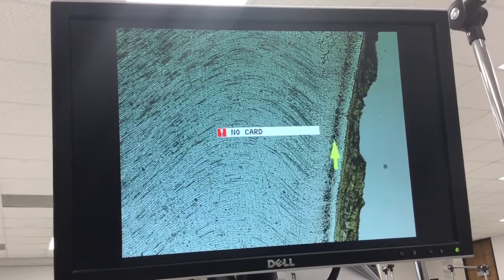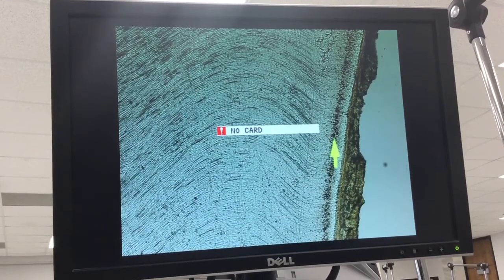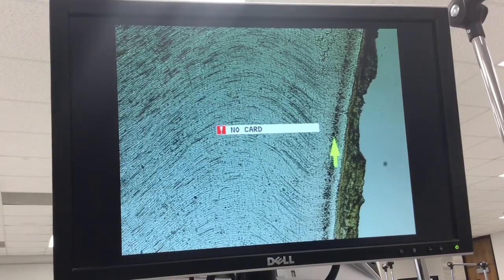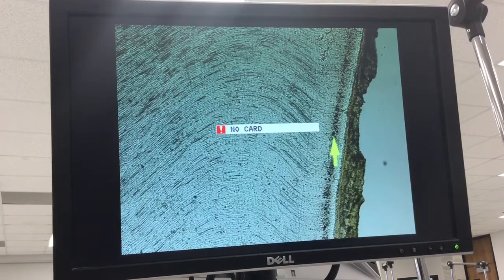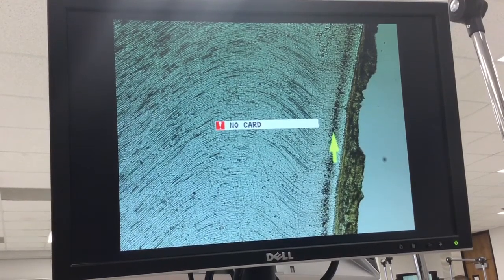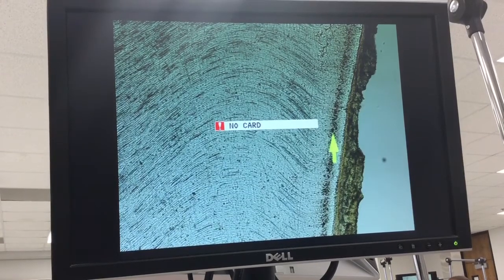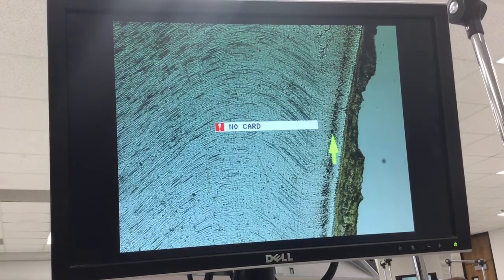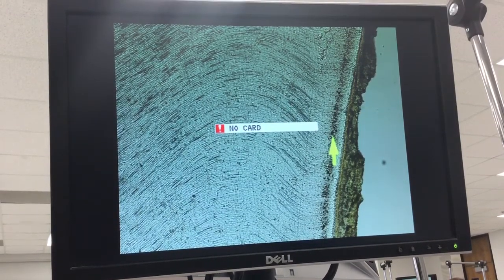Okay? And you ought to be able to get them to fuse and see a 3D depiction of that dentinal tubule, and see that some of those collagen fibers kind of bridge the gap almost. Although this is a ground section, it was slightly demineralized to get rid of the peritubular dentin. So that's gone, so all you see really are the collagenous fibers.